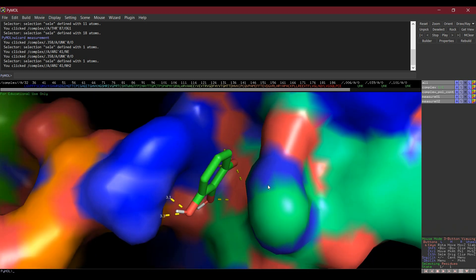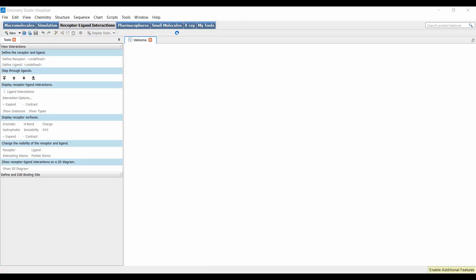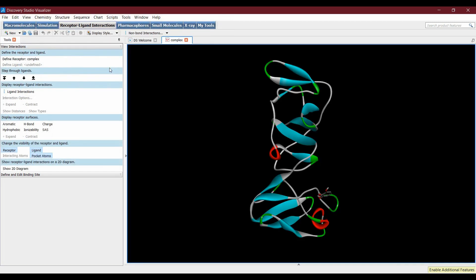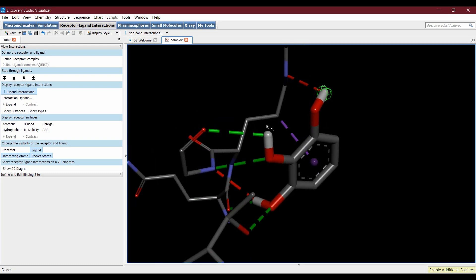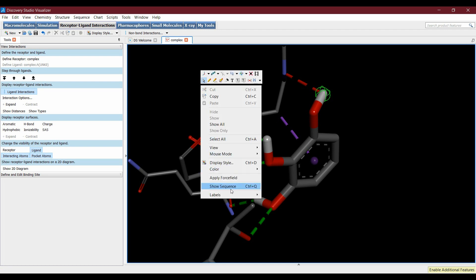You can also analyze your results in Discovery Studio. Open Discovery Studio, then from File > Open, open the complex file. Click on Ligand Interactions — this will show the interaction of the ligand with the protein residues.